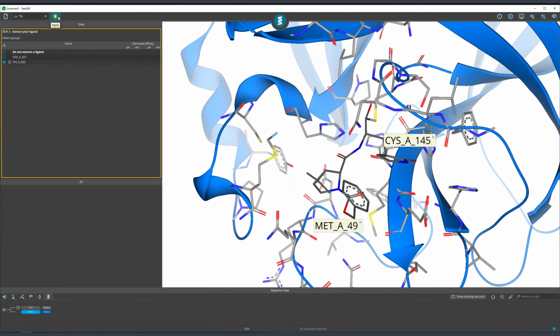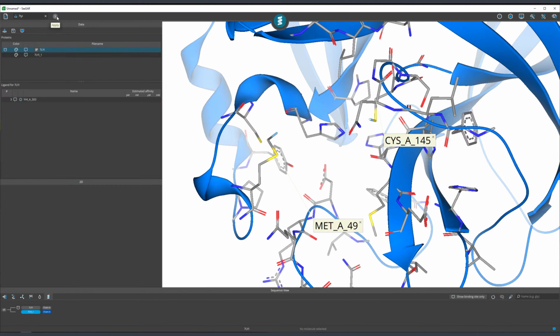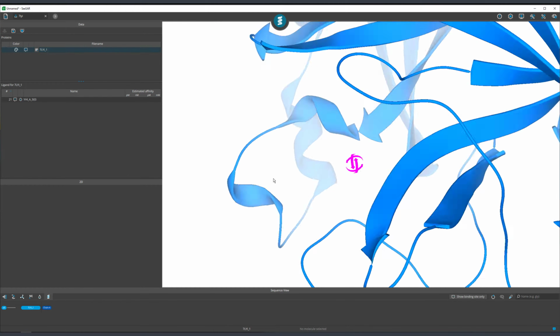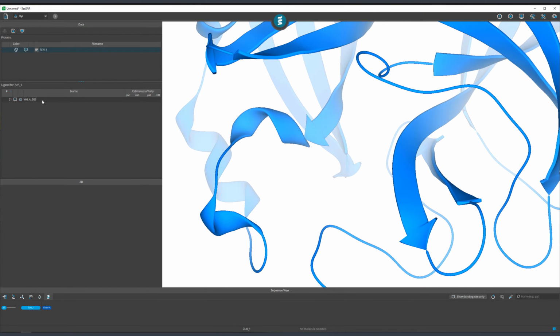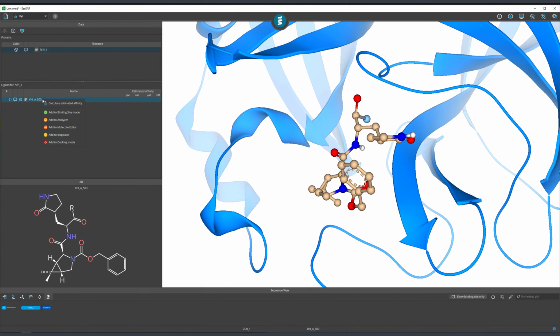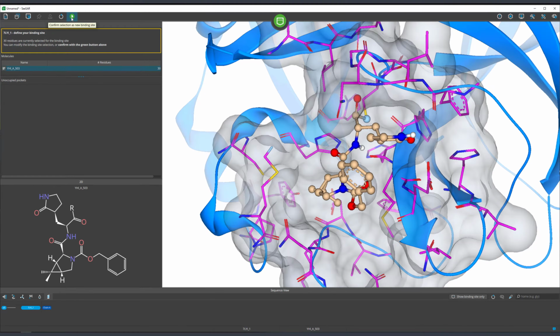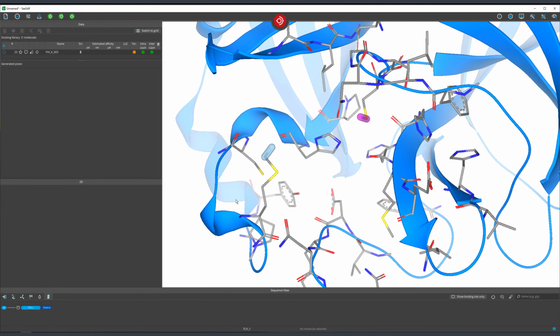Select our covalently bound ligand since the binding site is essentially the same. Delete this initial version of the protein since it is not of any use to us now. Quickly take this molecule into the binding site mode to confirm that this is still our binding site of interest. And from here, we could now take the ligand molecule to the docking mode.